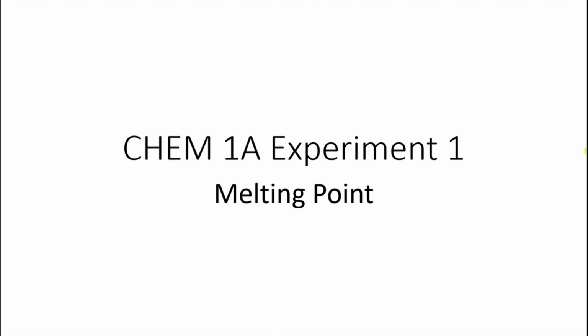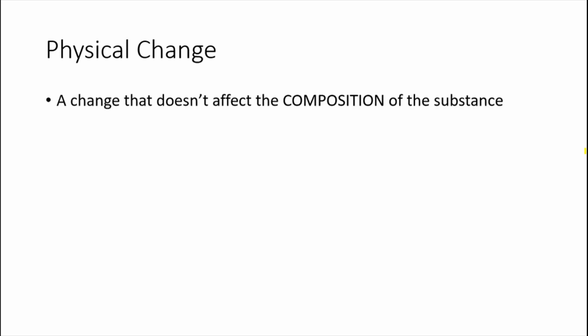Okay, students, today's experiment is about melting point. In class, we talked about what is a physical change. We said that it is a change that doesn't affect the composition of the substance. In other words, the substance is still the same identity as it was before the change happened.